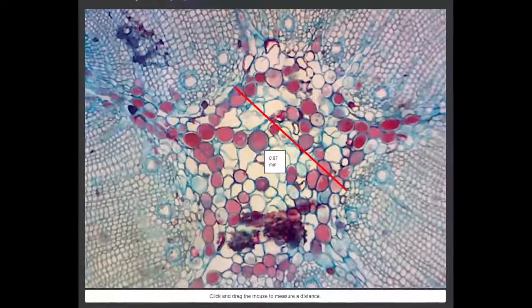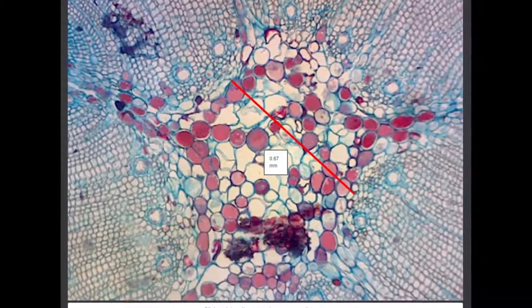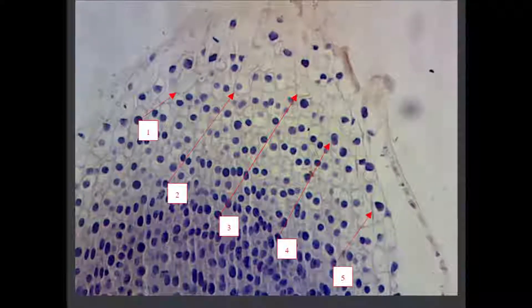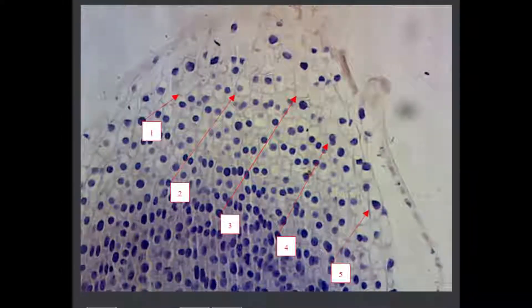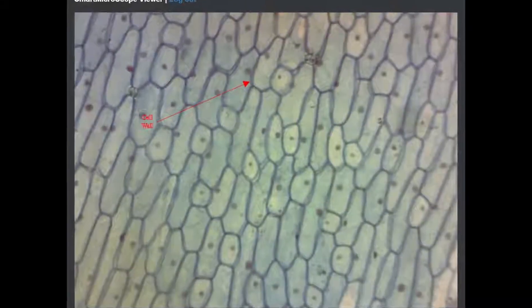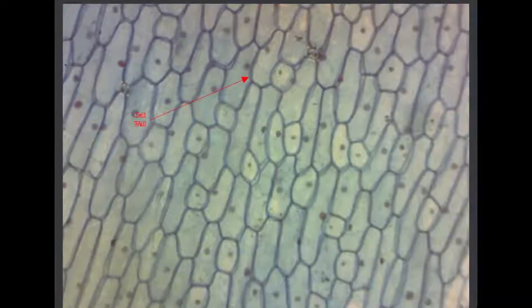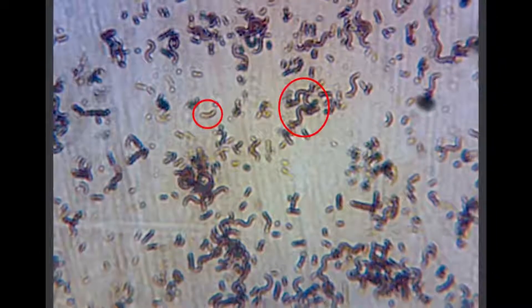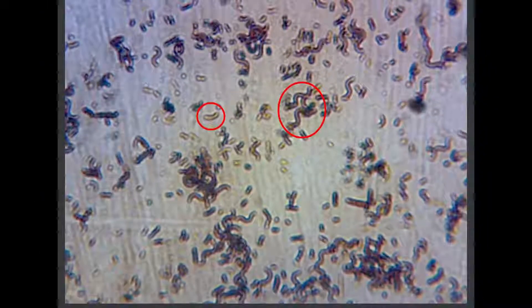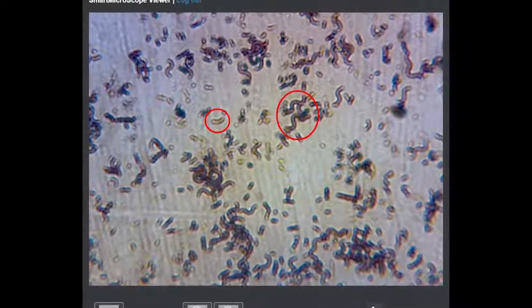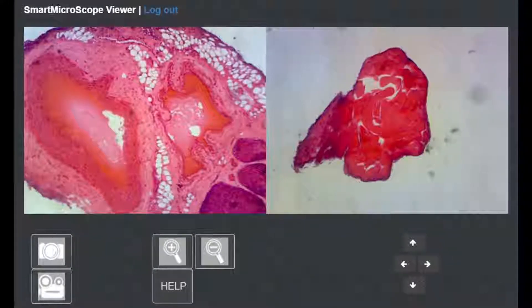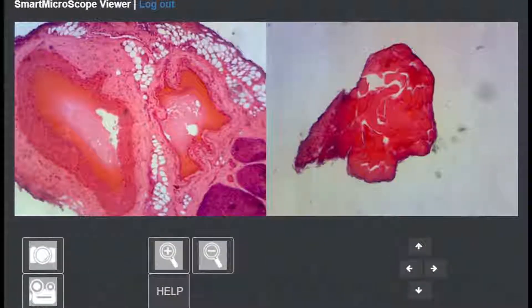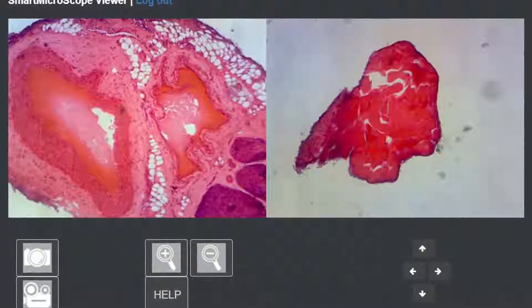Within the online app, you can measure, do a quick assessment to see what students have learned, add annotations to live or saved images, draw a movable circle to point out areas of interest, and compare two images side by side. See the difference between an artery and a vein?